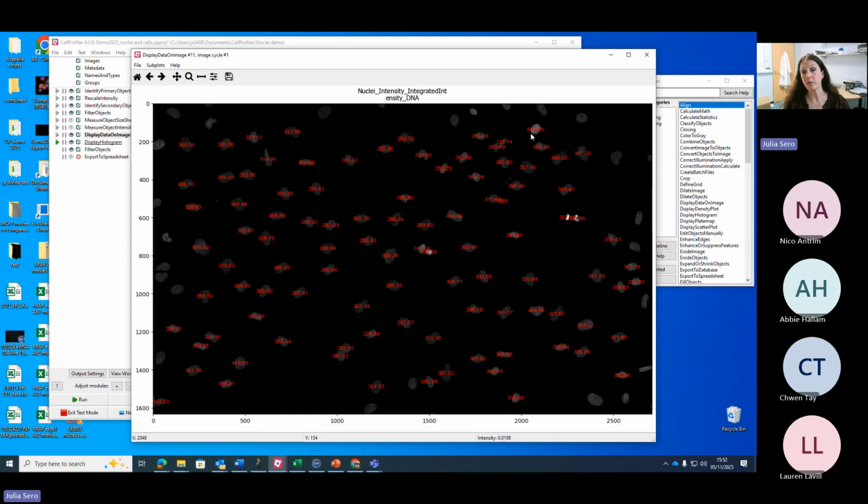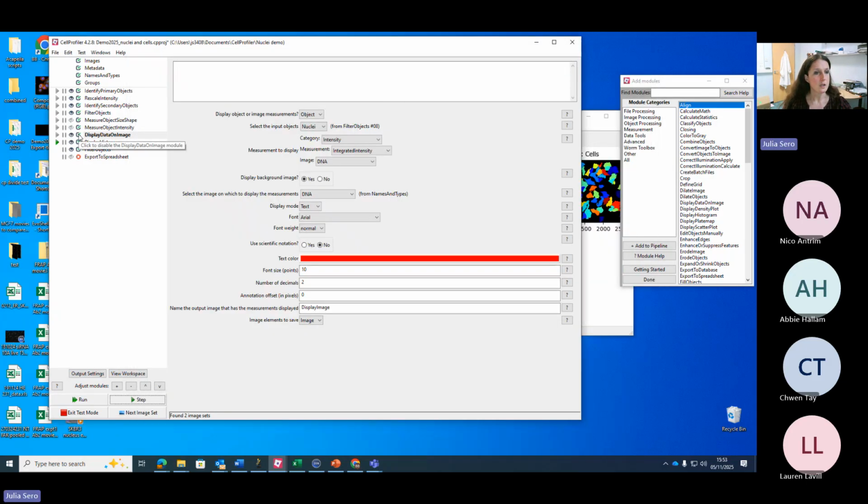Here's another one that I remember was EDU positive, and this is 628, so that's about double the 300-ish that the other non-EDU positive cells in G0 or G1 have for DNA intensity. All right, so I'm just going to untick that because I've seen it, I've played with it. I don't need to run it in the batch analysis.